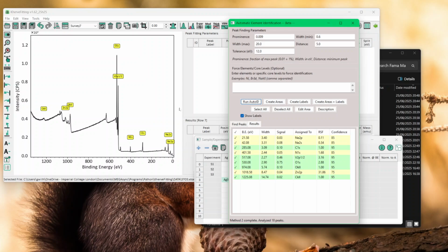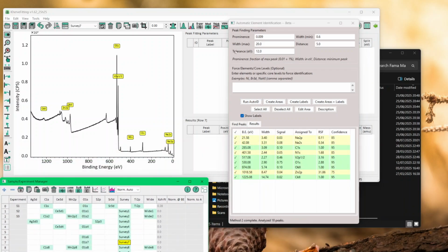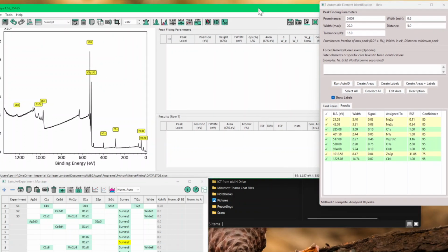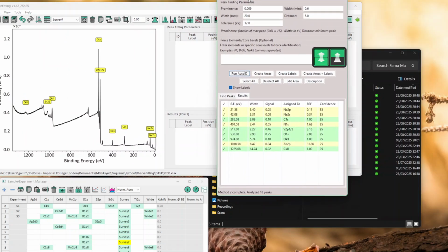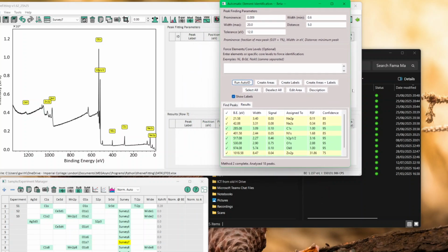And we can see in here, if I just remove this one right there, we can see in here that you have 1000. So sorry, I'm trying to get this binding energy shown. So this should be, yeah, sodium 1s. So it failed for sodium 1s.